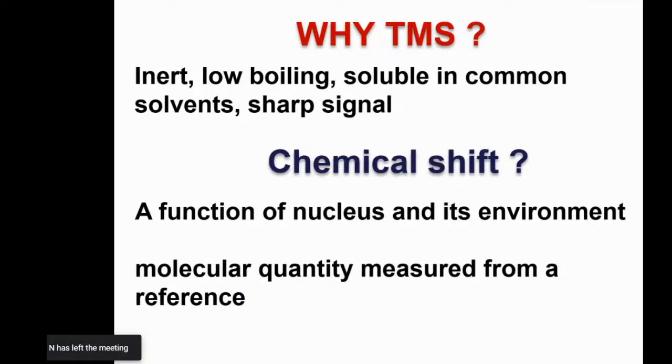And TMS is used for proton and C13 because it is inert, low boiling, and it is soluble in common solvents. It gives a sharp signal. And also it doesn't interfere with the sample signal.